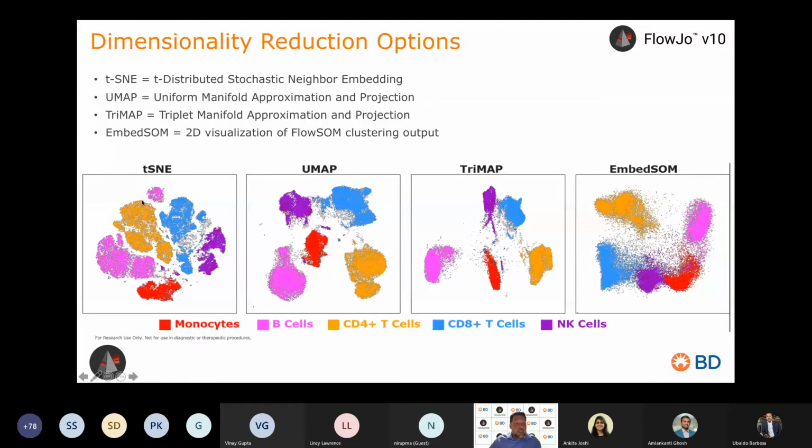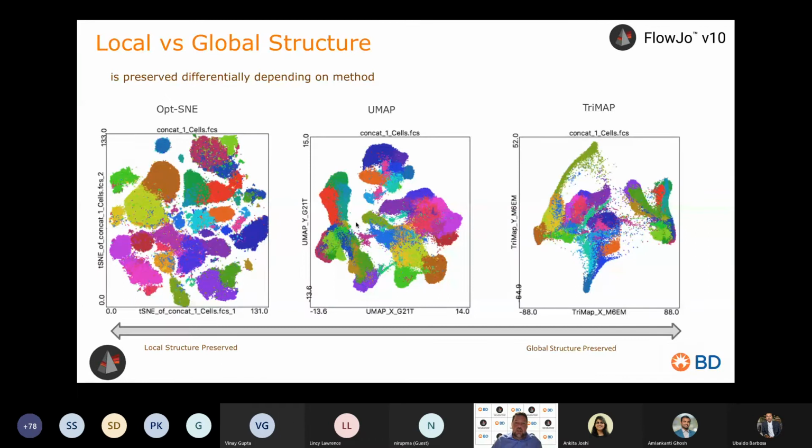Using both, maybe T-SNE and UMAP, is the best way to get a best overall view and look at alternative views, and you choose the representation that best fits what you're trying to tell your audience in your presentation or publication. Now this is another data set.